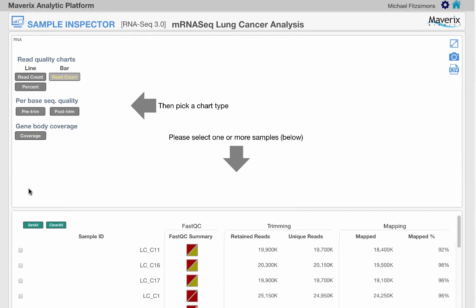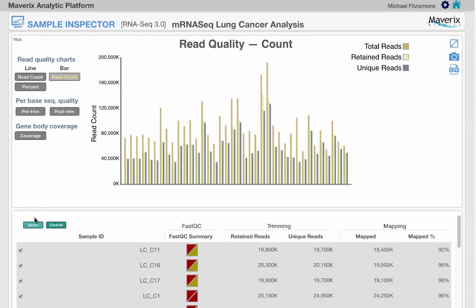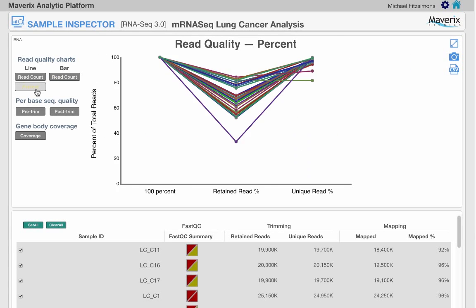The charting area will include whichever samples are selected at the bottom and display whichever chart type that is chosen on top.